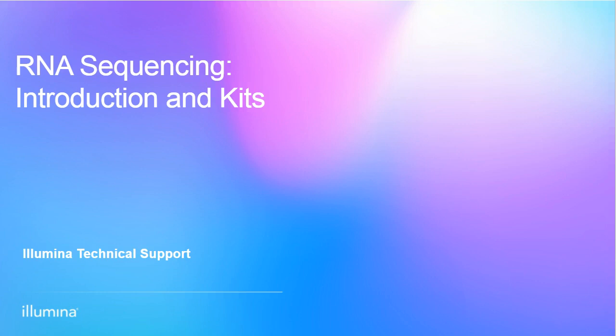The purpose of this introduction is to understand the workflow for RNA sequencing from RNA isolation up to data analysis. We want to understand key considerations in planning mRNA and total RNA sequencing and consider them before we start processing our samples. We will then take some time to focus on the kits specifically. Again, this is part 1 of a 3-part webinar series on RNA sequencing. Part 2 will discuss best practices, and part 3 will dive into analysis.